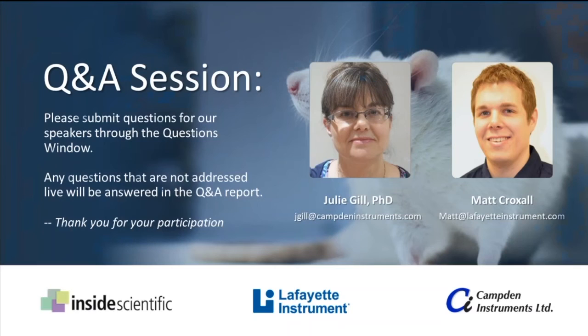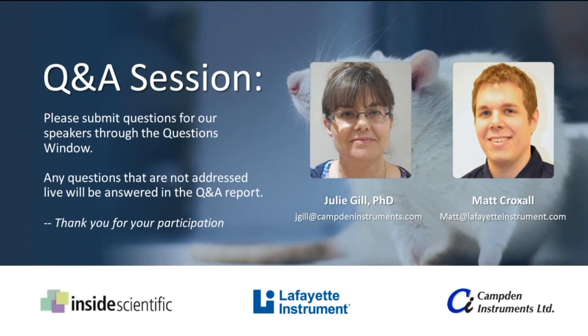So I will now hand over and we will go to our question and answer session. Matt, during the registration process and throughout this presentation, people have asked about integration with other technologies. And I understand that you've prepared a few extra slides just to provide a bit more detail about integrating the Bussey-Saksida chamber with other equipment. So I'll let you just talk a little bit more about that.